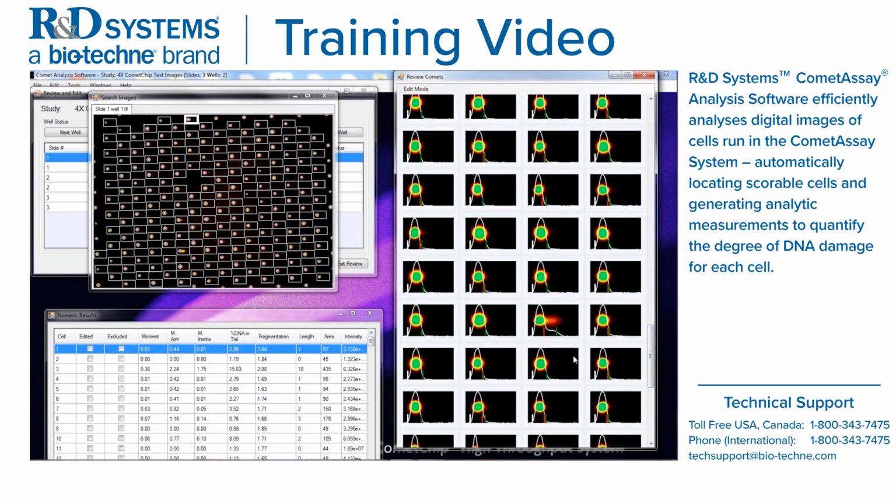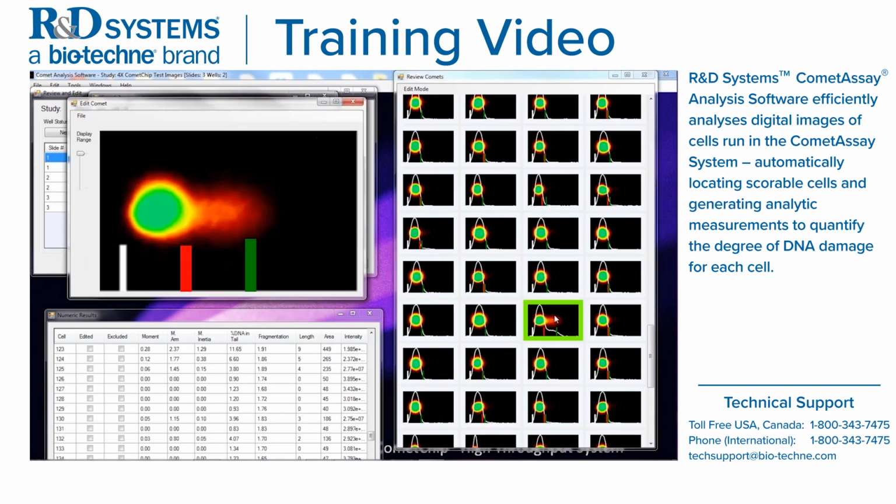Let's say you wanted to move the cursors around. What you would do is in the review and edit, double click, and you have another window that comes in specific for this. It's only in this Edit Comet window, when you double left click, that this Edit Comet window is going to appear. So within here, I strongly recommend you go under File and you show the intensity profile before you begin moving these cursors.